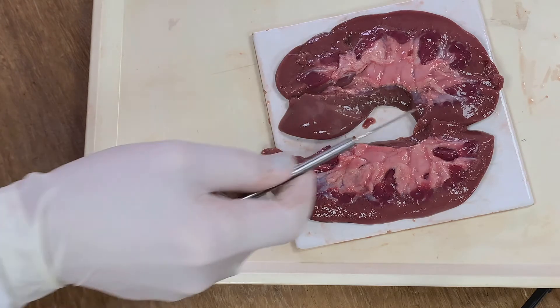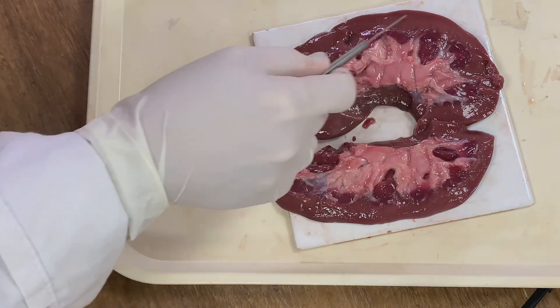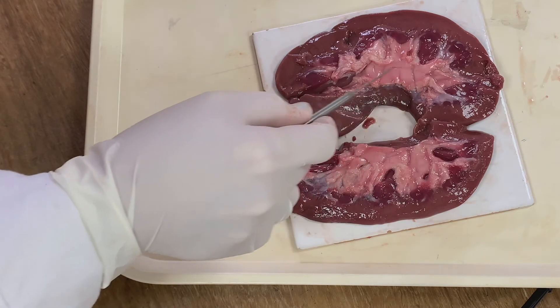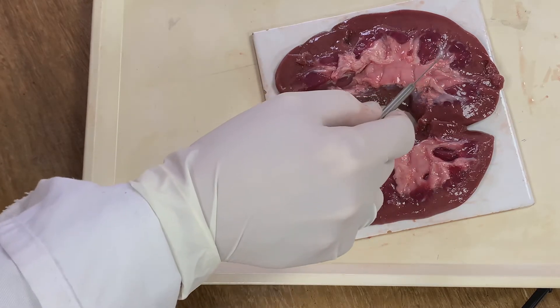The cortex is found around the outside and is a brown colour. It is where the Bowman's capsule, the proximal convoluted tubule, and the distal convoluted tubule are found.